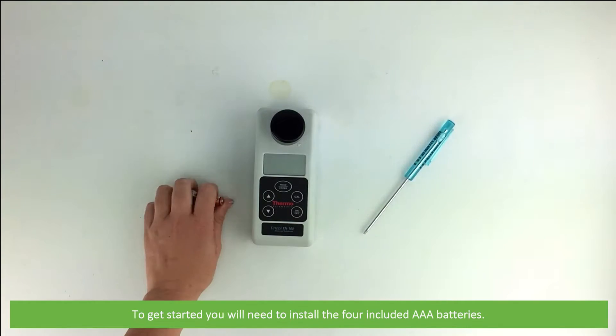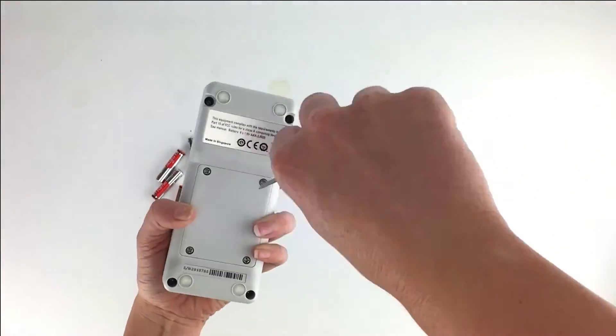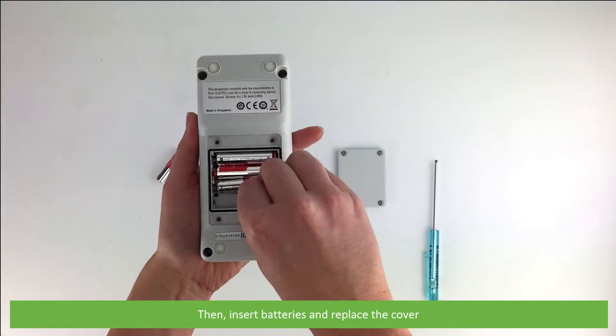To get started you'll need to install the four included AAA batteries. Use a small screwdriver to remove the rear battery cover, then insert the batteries and replace the cover.